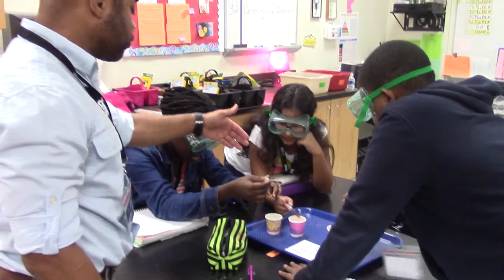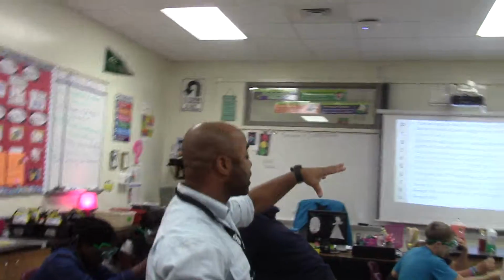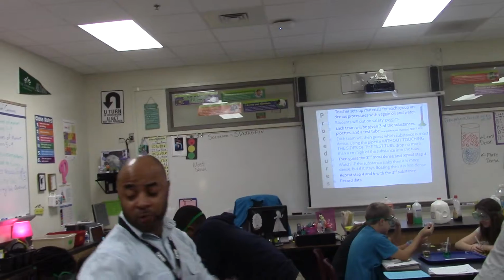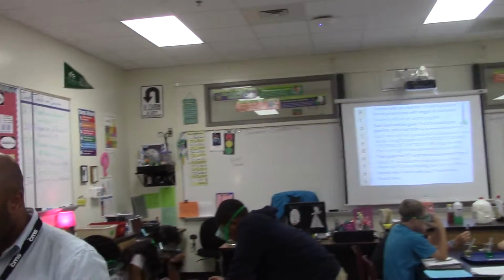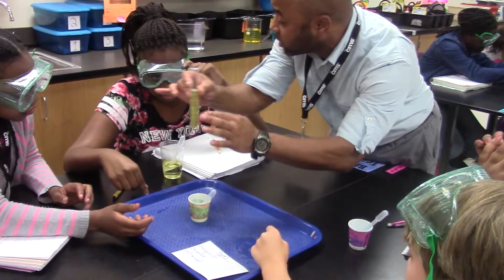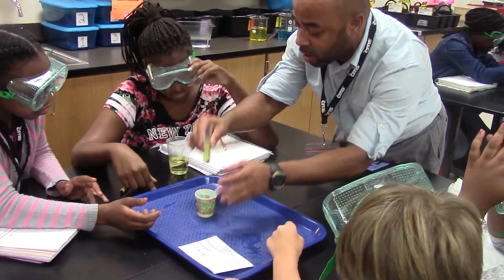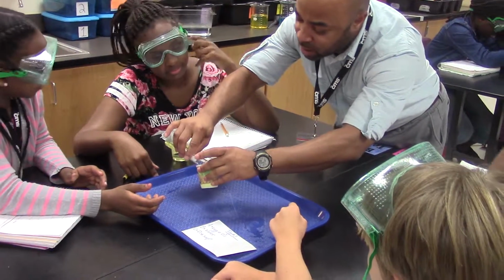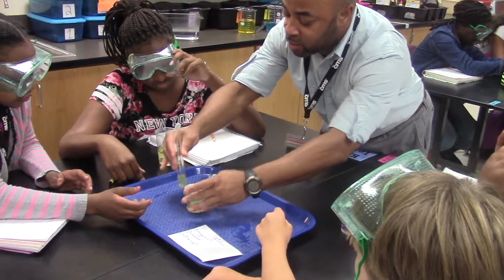All right, hold it over the tray. Make sure you guys are holding your substances over the trays. We don't want any to get on the table. All right, so just a little bit, you don't need that much. So this is what you said was going to be the most dense. All right, so that's about it. So this was your most dense.